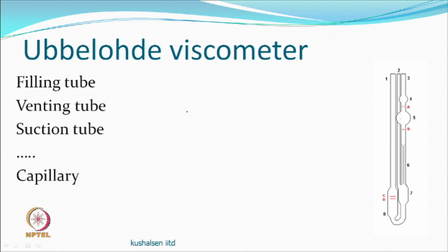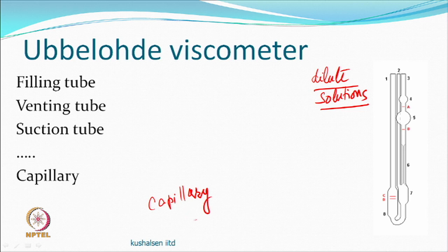So, if you are actually dealing with relatively dilute solutions, then this type of viscometer, which is called the capillary viscometer, can be used.